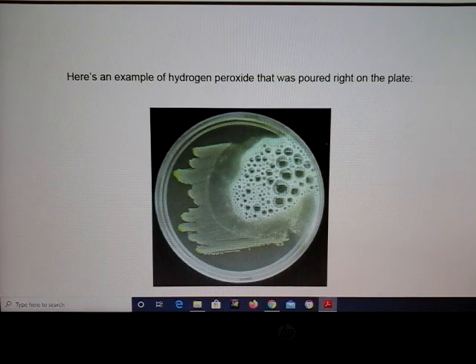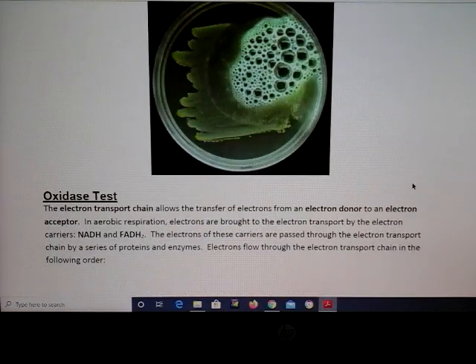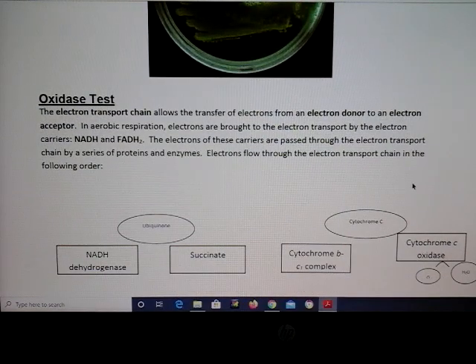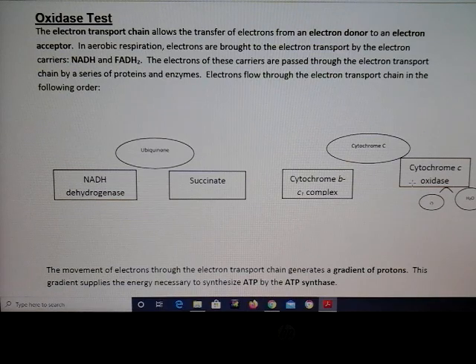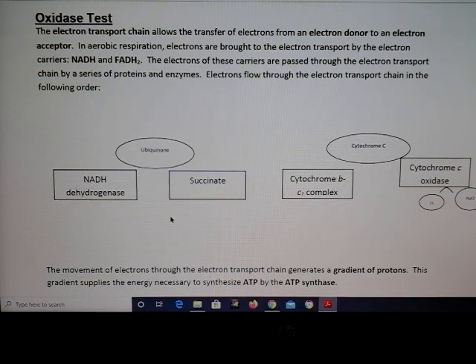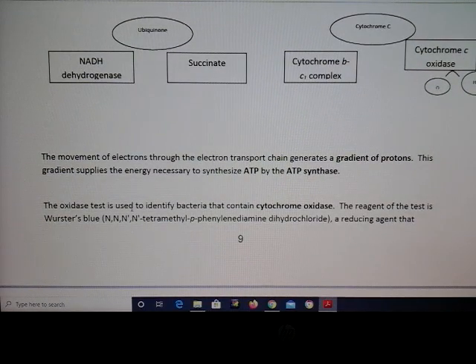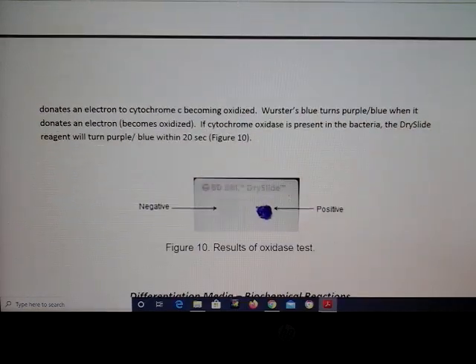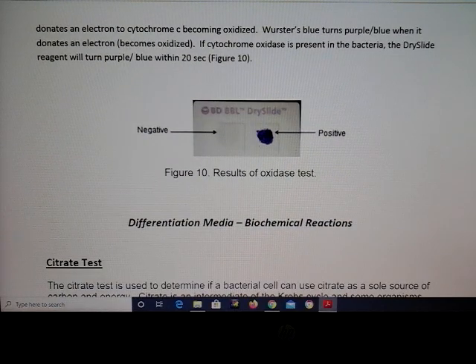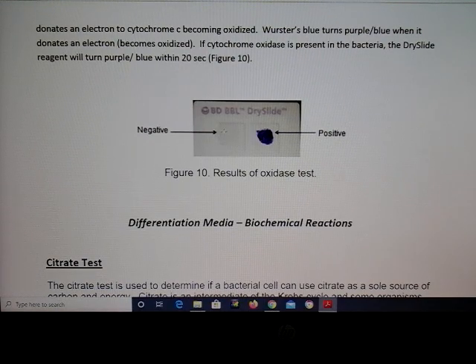Here's another nice picture showing all those bubbles from the catalase test. For the oxidase test, we are looking to see if a reduced compound is going to be oxidized. The color goes from clear to blue. You're looking for whether the bacteria contains cytochrome oxidase. A positive result shows blue, and a negative result — shown on the left — does not contain cytochrome oxidase.